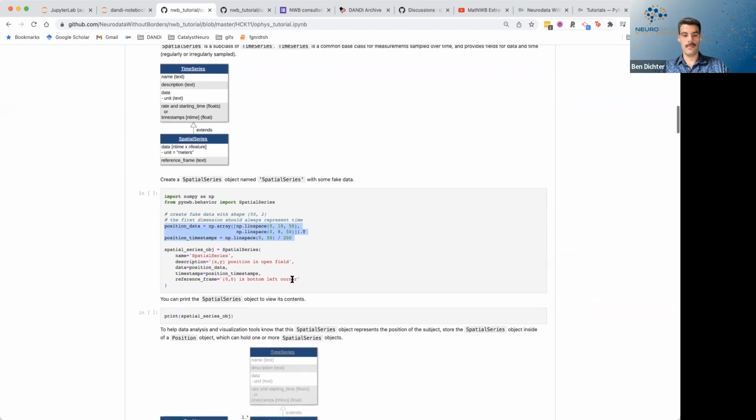Okay. Yeah, I guess we do have a little bit more complex data in that we do zebrafish larvae and we're tracking tail movement. So we have, let's say, 20 tail positions. Each one has an X and a Y and then an angle associated with it. So I guess that would be 60 data points per image that we have, and then the time series expands from there. Yeah.